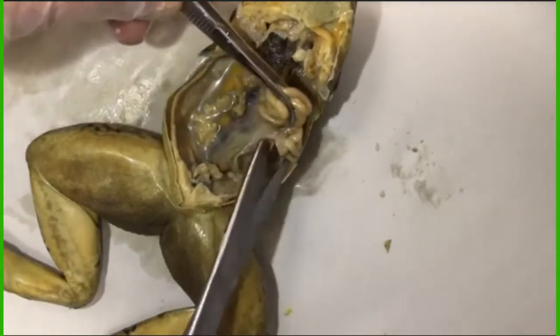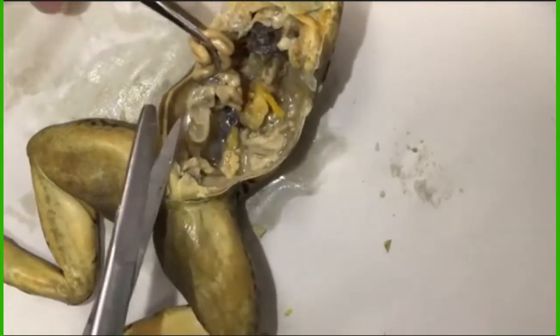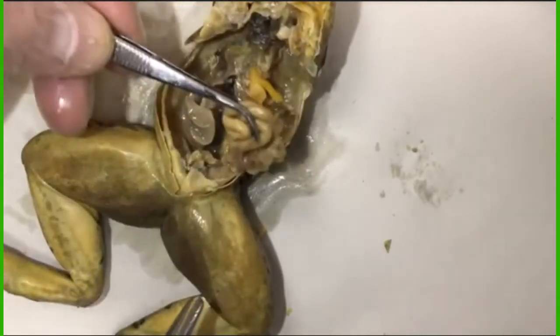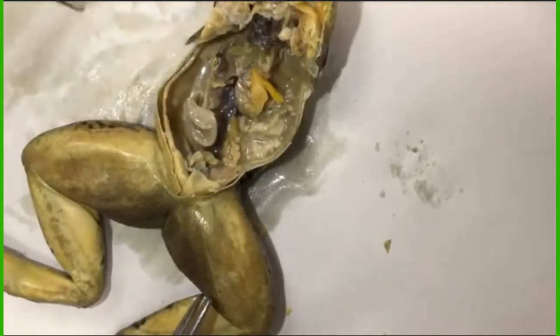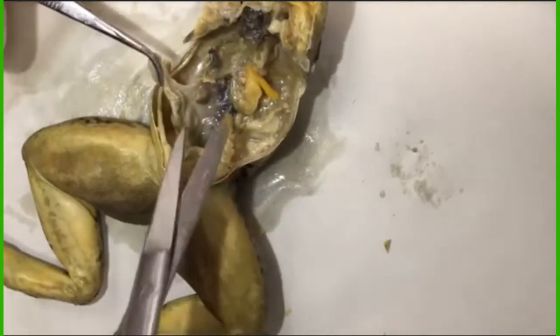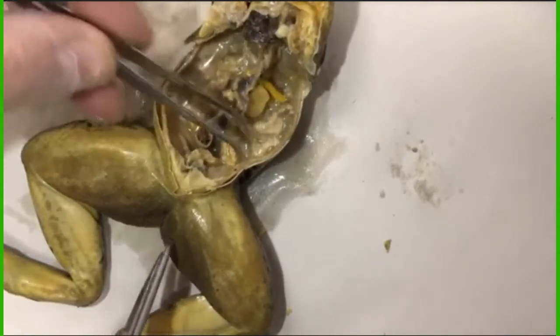All right. There's small intestine right there, attached to the large intestine. There's the bladder right there that I just moved with my scissors. So there's the small intestine that I just removed. And bladder right there, right above where the large intestine is. So I'm cutting the large intestine. I opened it up and you can see what's left of probably feces right at that one opening.